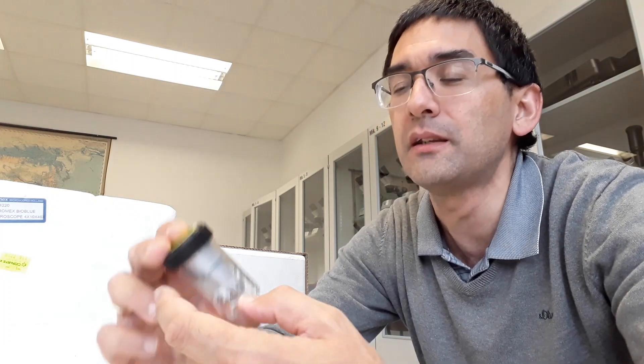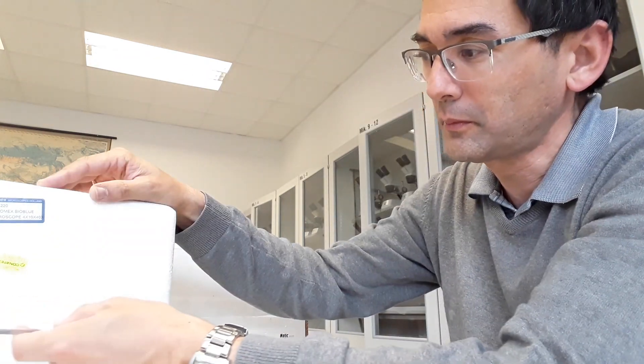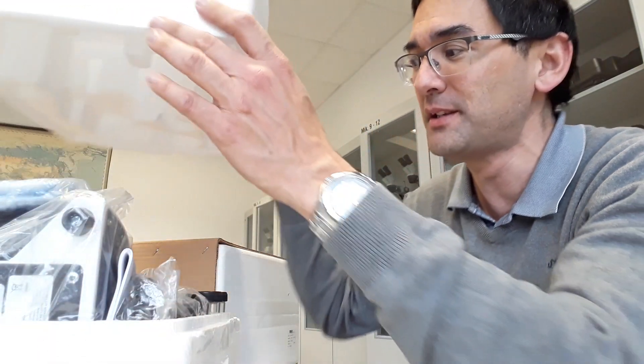These are the two samples and we're going to have a look at them, and in this process, maybe I can also explain to you why we decided on these particular features. What I also requested is that they include a 60 times magnifying objective here, which they have done. But what we're not going to do is we decided very quickly that we're not going to use oil immersion and we wanted to have monocular microscopes. So this means microscopes with only one eyepiece. I was, however, informed that they did not have one of them in stock. So one of them is going to be a binocular model, but it doesn't matter because we can still see generally how the handling of the microscope is like.